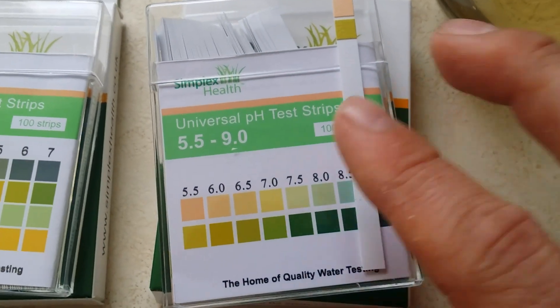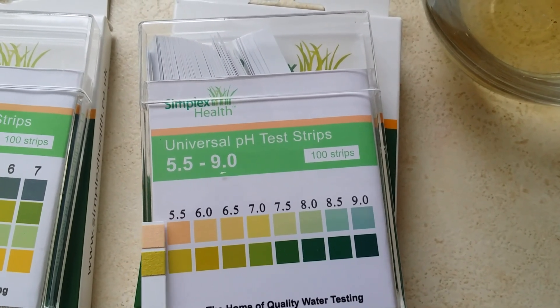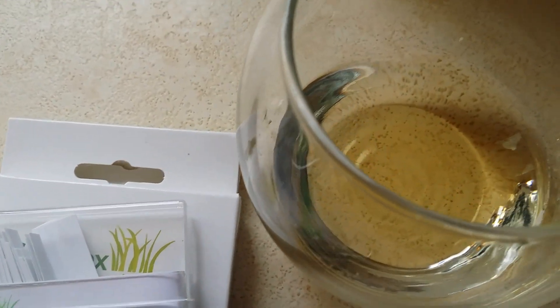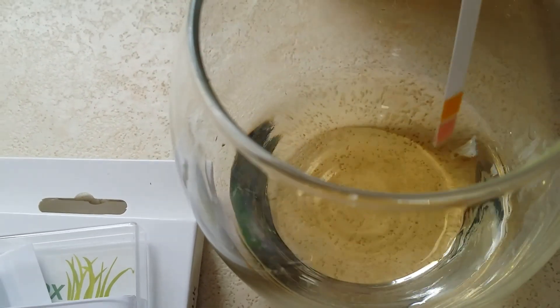So because the pH is between 2 and 3, with the 5.5 to 9 strip you should get a real color change towards the low end. Obviously the pH won't be 5.5 — it will be lower than that — but I just want to demonstrate how the strips work, how easy they are to use, and show that you can use them on other liquids too.